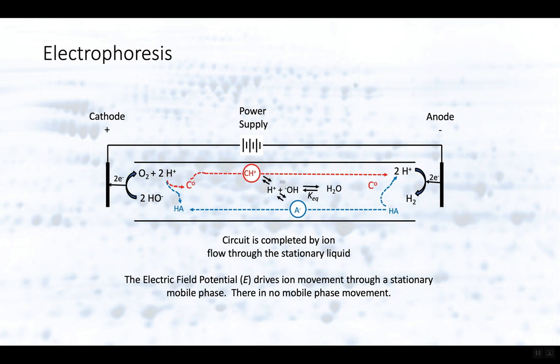It's a very rapid process. Proton exchange is a very rapid process compared to the overall movement of ions in the electrophoretic channel. This is the challenge in actually modeling, or solving the models, for electrophoresis.